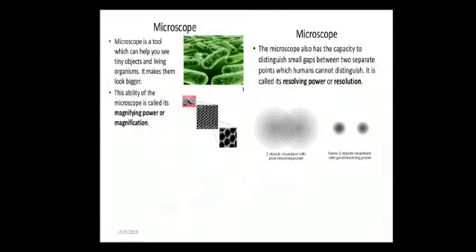A microscope is a tool which helps you to see tiny objects, whether a living or non-living organism, with a size of micrometers or less than a millimeter, which we cannot see or distinguish with the naked eye. Such materials, components, or objects we can see only through microscopes.